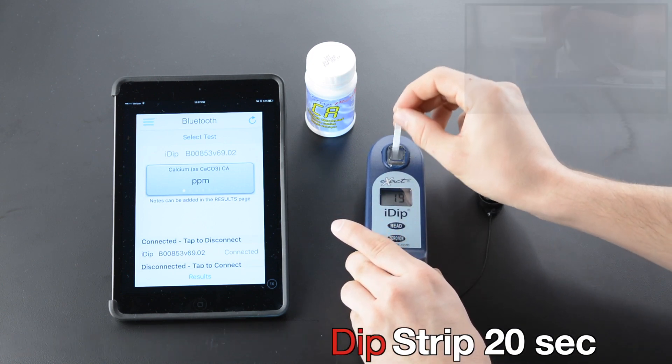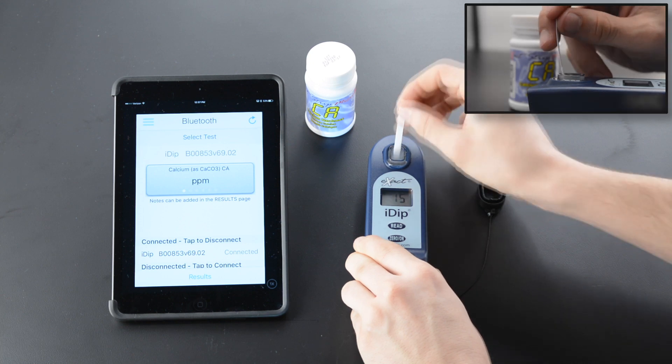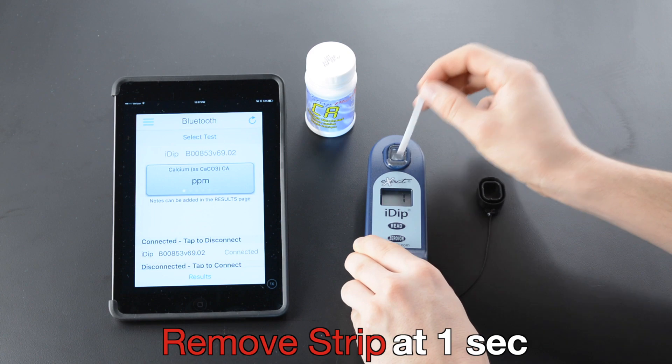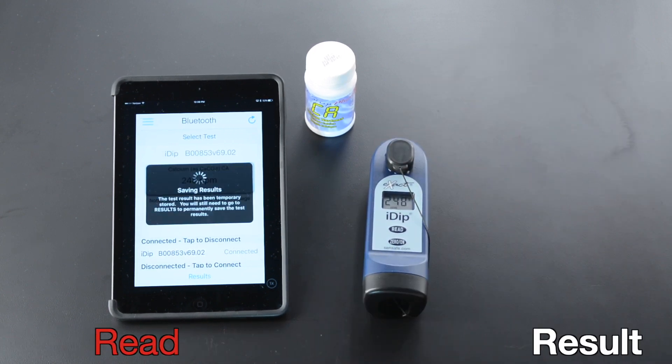Remove cap and press read. Dip strip 20 seconds, two strokes per second. Remove strip at one second. Replace cap and read result.